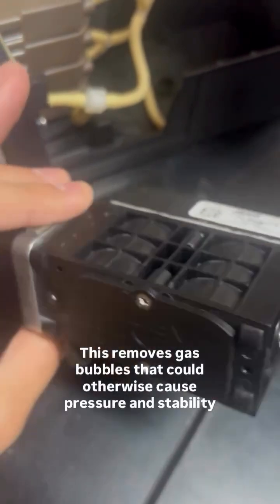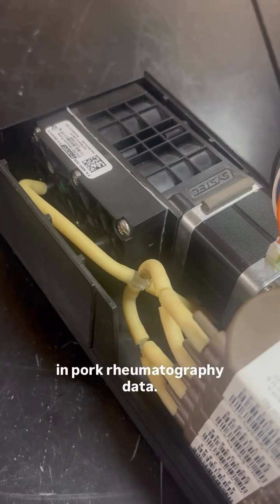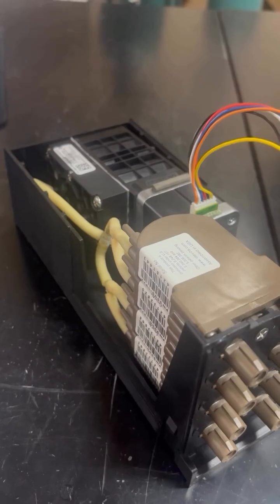This removes gas bubbles that could otherwise cause pressure instability and poor chromatography data. Over time, the camshaft or internal bearings can seize up, causing vacuum errors or inconsistent data.